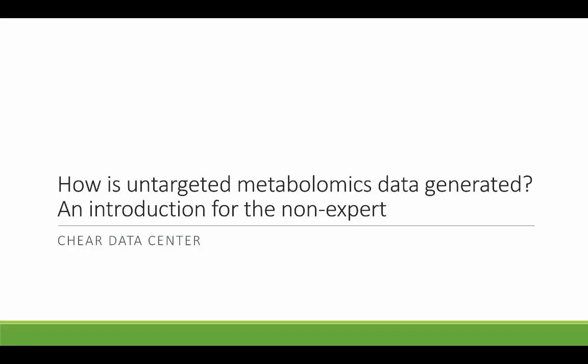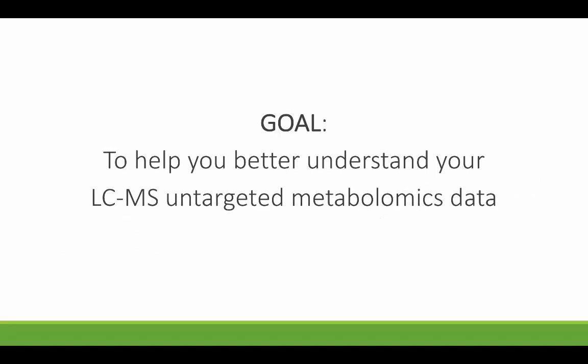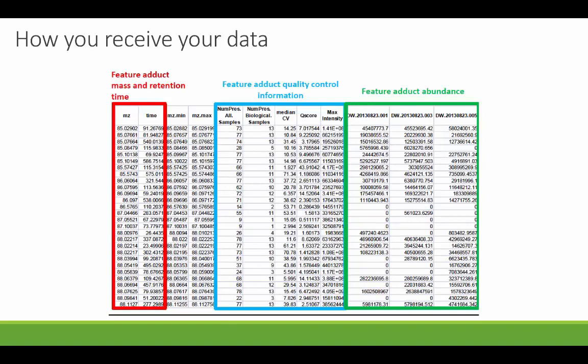Hi, this tutorial is designed for individuals who are non-experts in metabolomics who might be analyzing metabolomics datasets. The goal of this presentation is to help you better understand the untargeted metabolomics data that you may be analyzing. This is an example of a dataset that you may receive. This is what is called a fully untargeted metabolomics dataset.